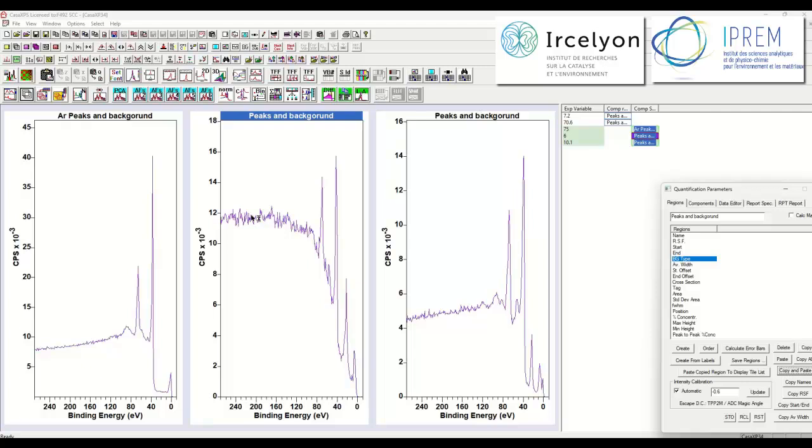So the rise in the background is related to vanadium passing through a material that does not contain vanadium, and hence we see this rise in the background. But this background may also include background signal due to the chemical state we see in this particular vanadium oxide here, and also the metal. So this vanadium background signal is not unique to this particular vanadium oxide.